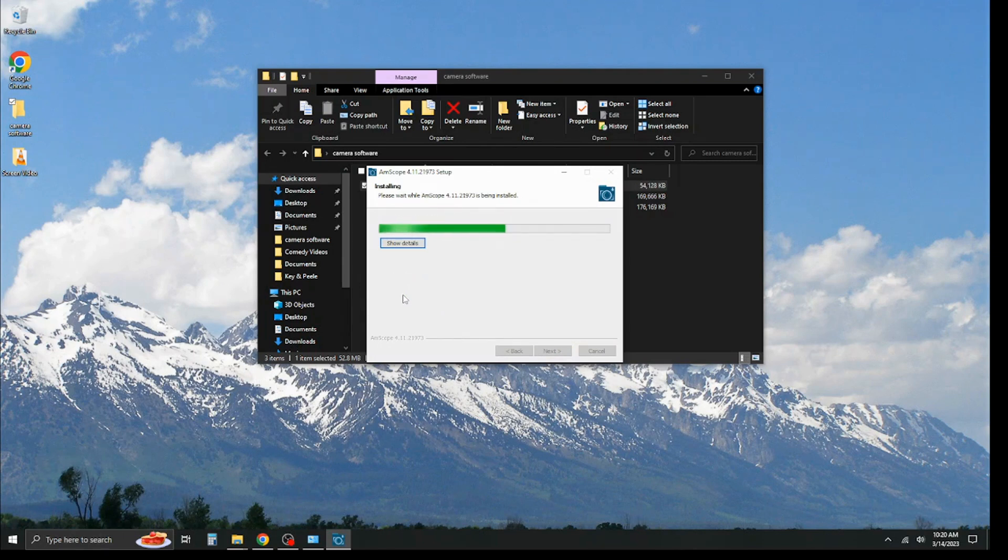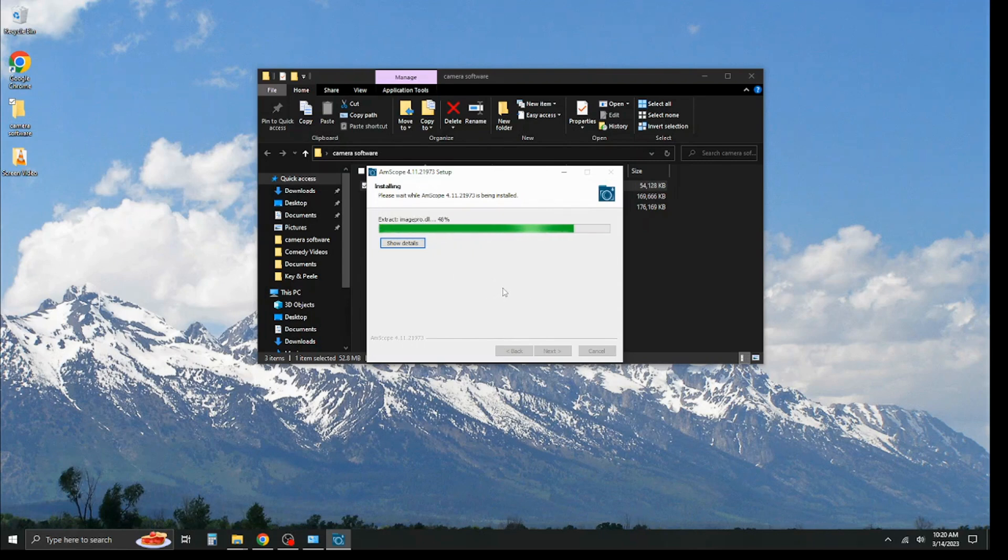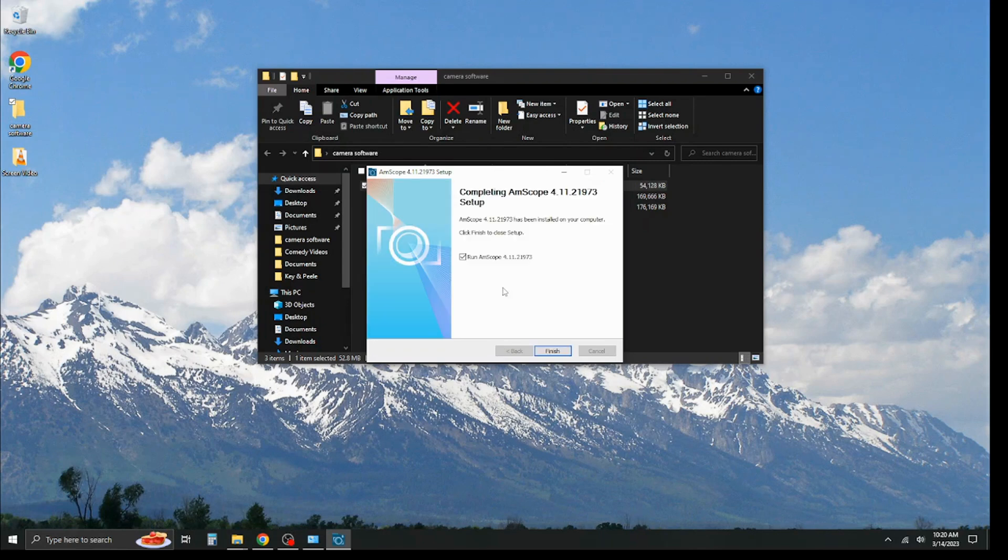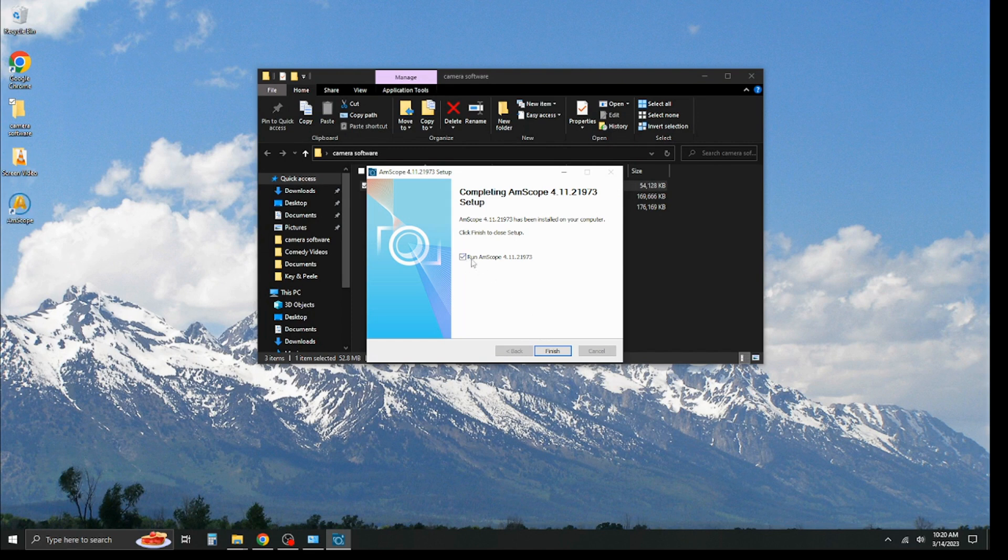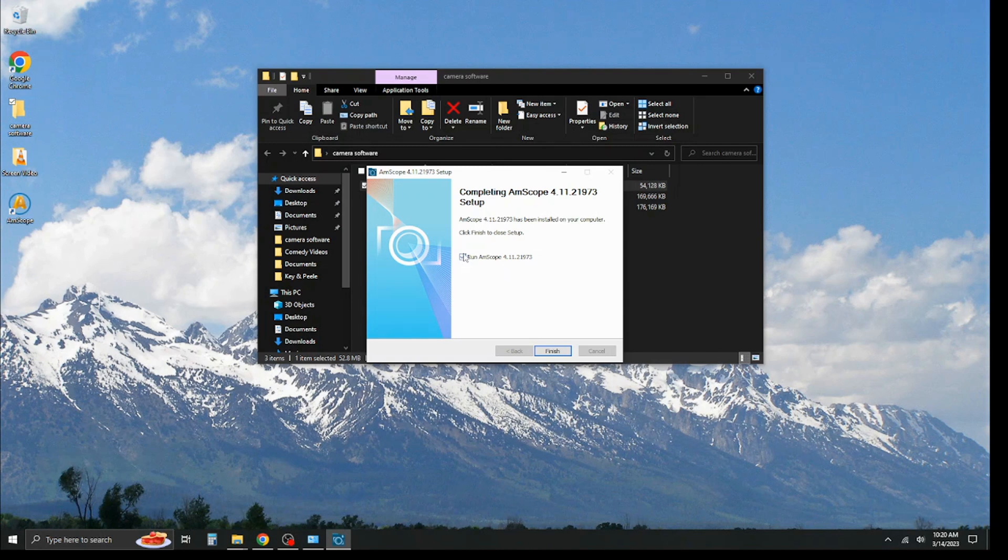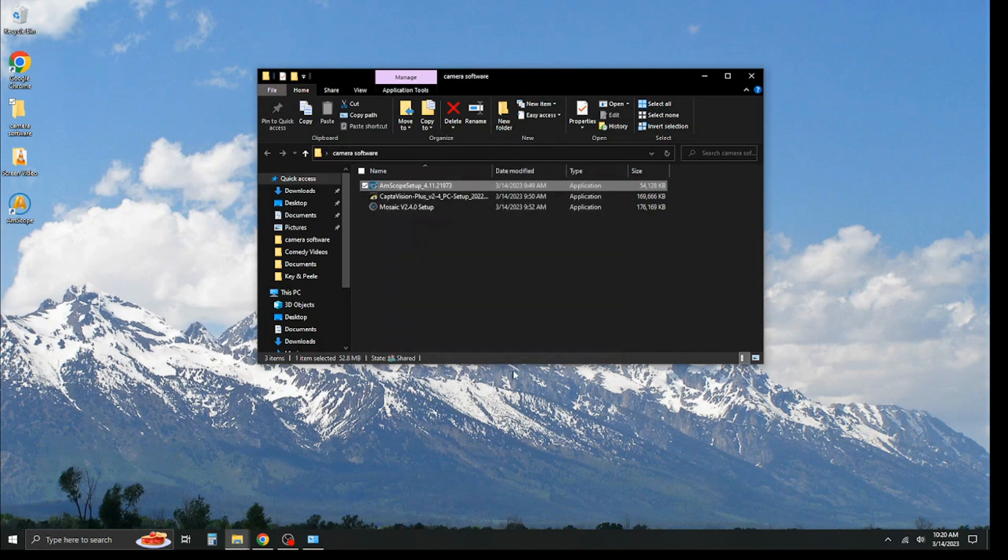It shouldn't take too long. It's a fairly basic program. Go ahead and let it run, and it's preset to go ahead and launch the software. If you don't need to launch it right away, you can uncheck that, and then you hit finish.